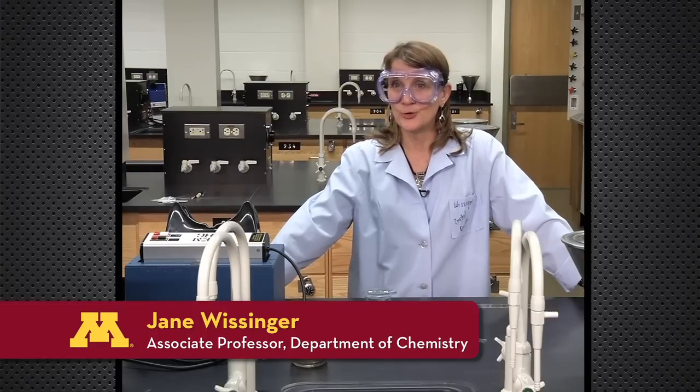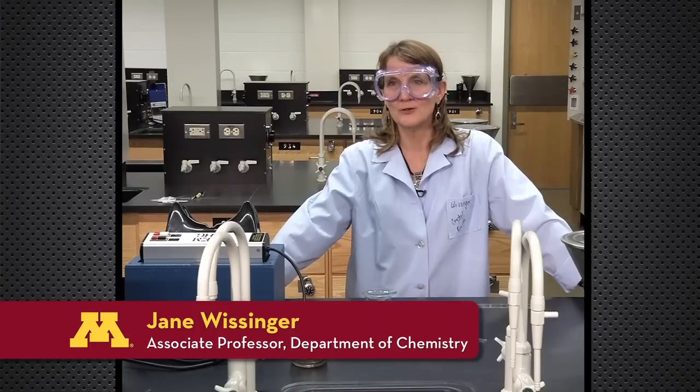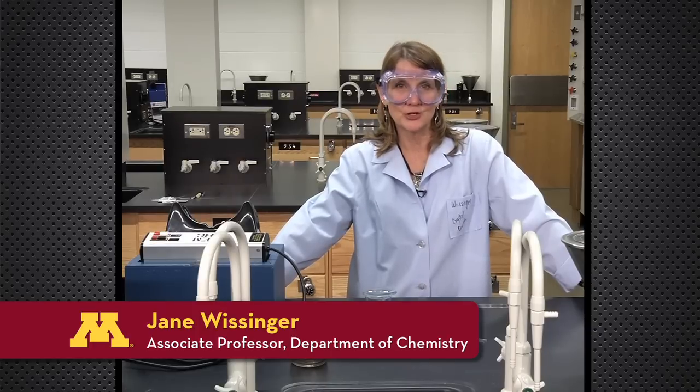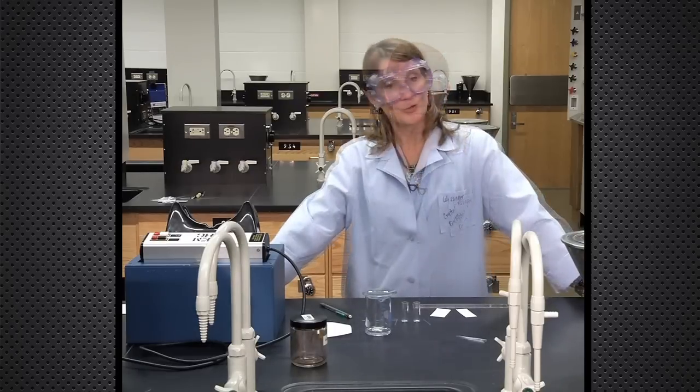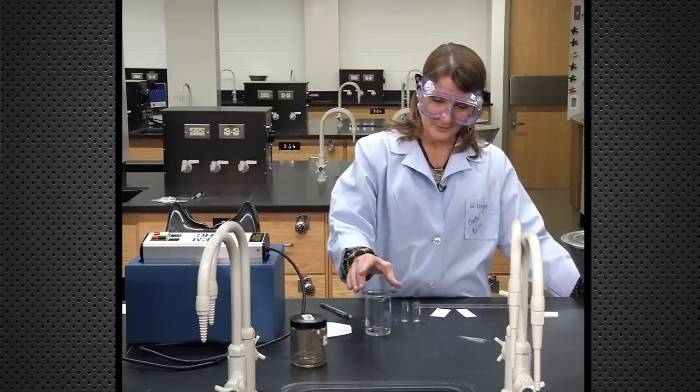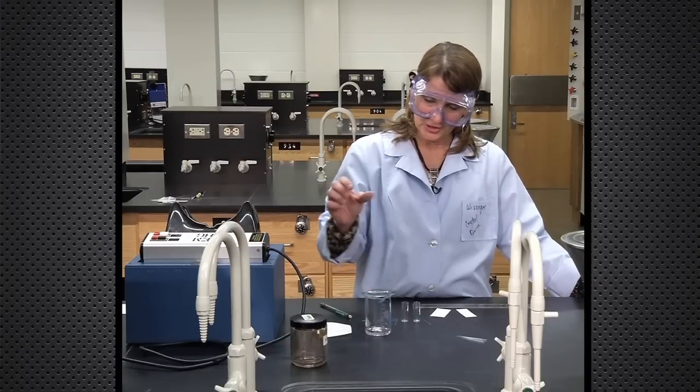TLC or thin layer chromatography is used as a qualitative tool for either monitoring reactions or following column chromatography. The equipment you need is a developing chamber, and what I have here is a beaker and a watch glass.